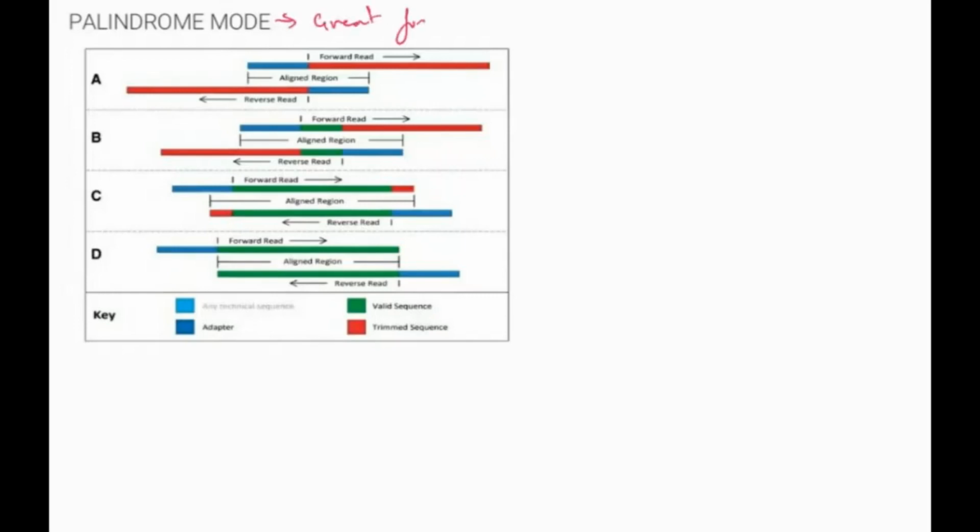It is specifically aimed at detecting this common adapter read-through, where the sequenced DNA fragment is shorter than the read length, resulting in adapter contamination. And this is how it works.